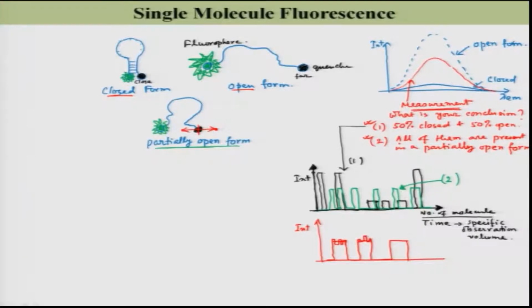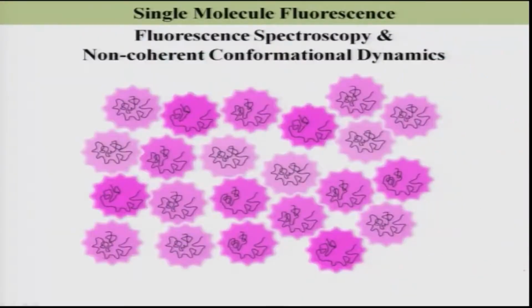Sometimes it is high, sometimes it is low, sometimes like this. So, that can be used further to calculate the conformational fluctuation dynamics. Okay, so just for your reference, I will write here conformational fluctuation dynamics.